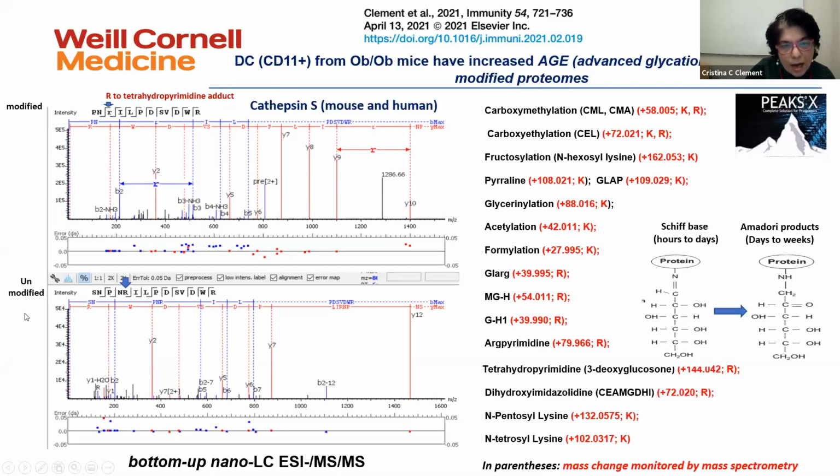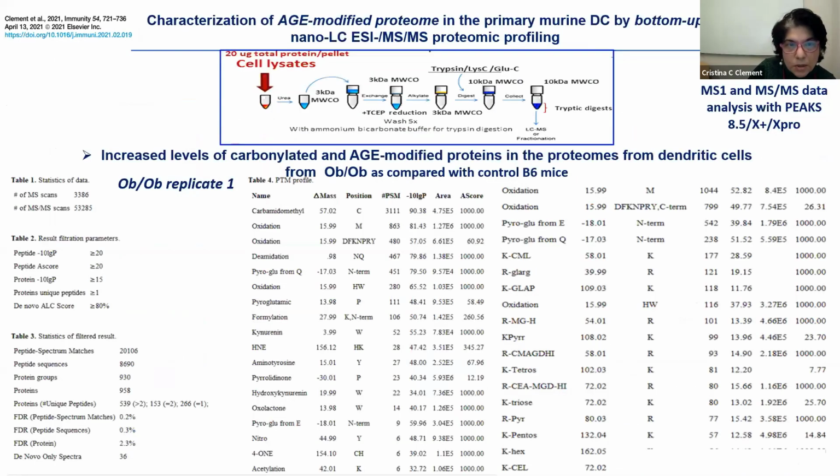So we have a high confidence in using PEAKS to identify this redox-mediated post-translational modification, both in the proteome and the immunopeptidomes. We use a typical FASTA file for the proteomics analysis in the late endosomal compartment and of the total proteome from the dendritic cells.